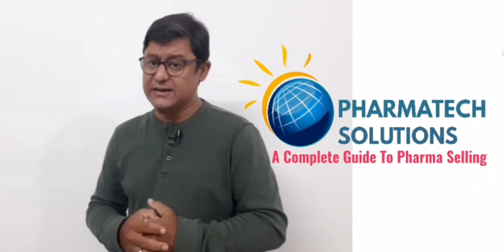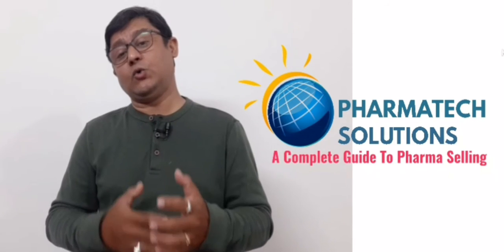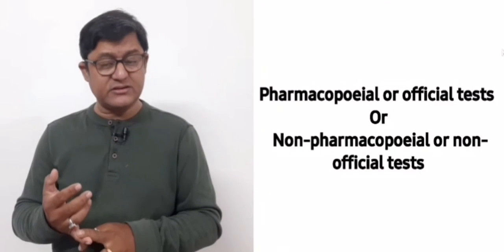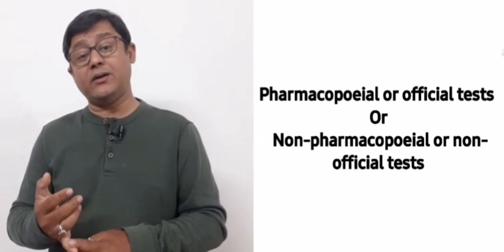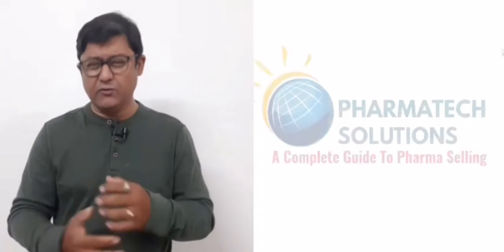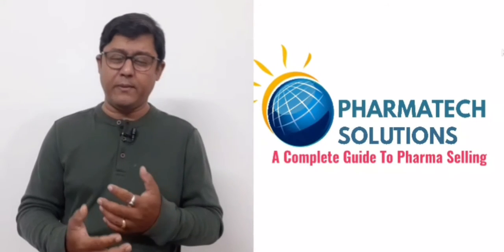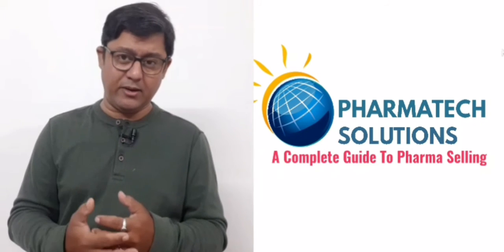Now, these tests can again be divided broadly into two categories. One is the official test or a pharmacopoeial test. Another one is a non-pharmacopoeial or a non-official test. Now we will understand what the pharmacopoeial test is and what the non-pharmacopoeial test is, one by one.